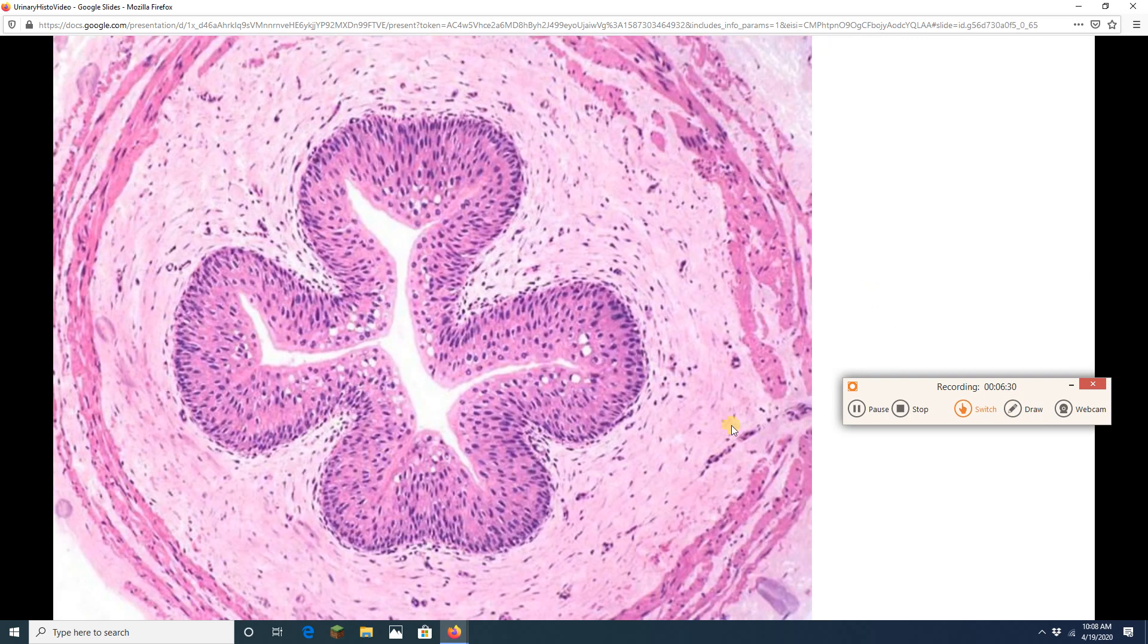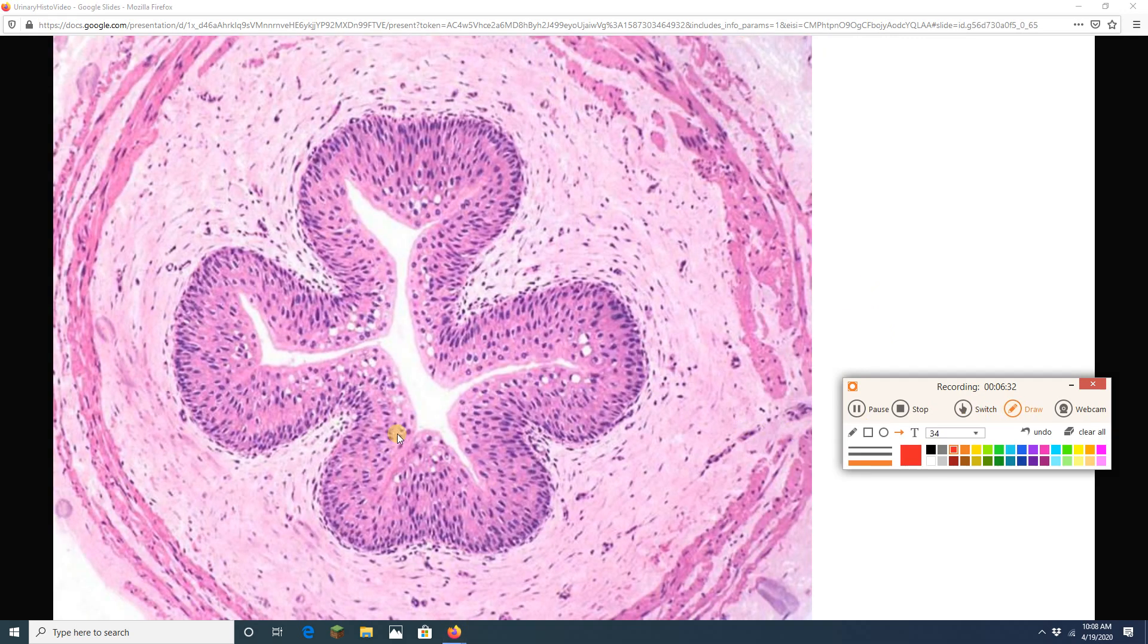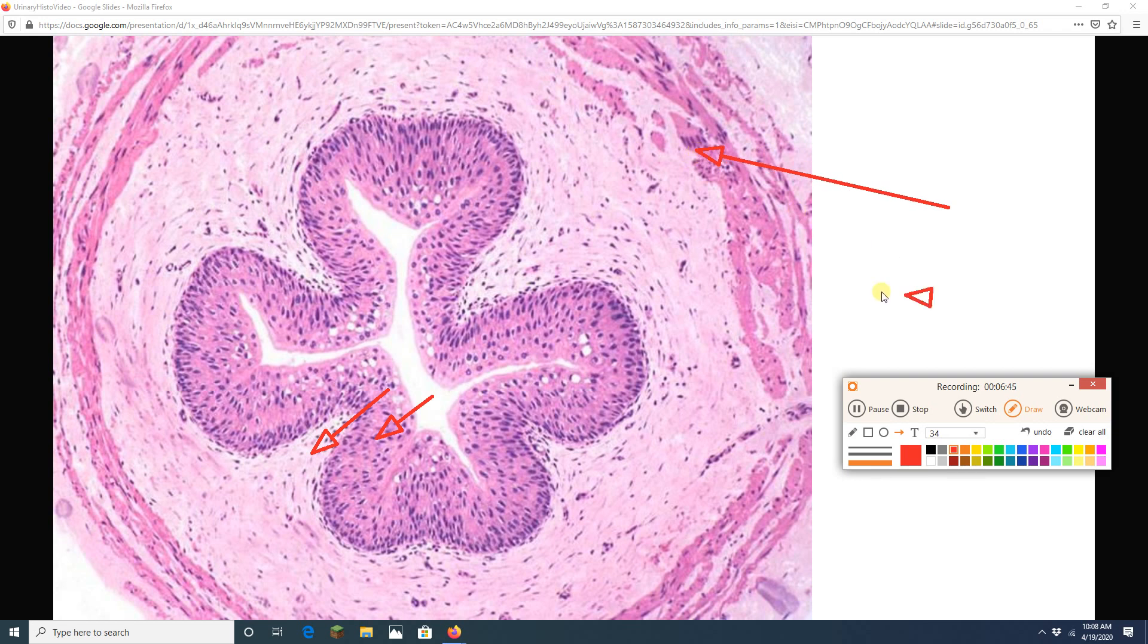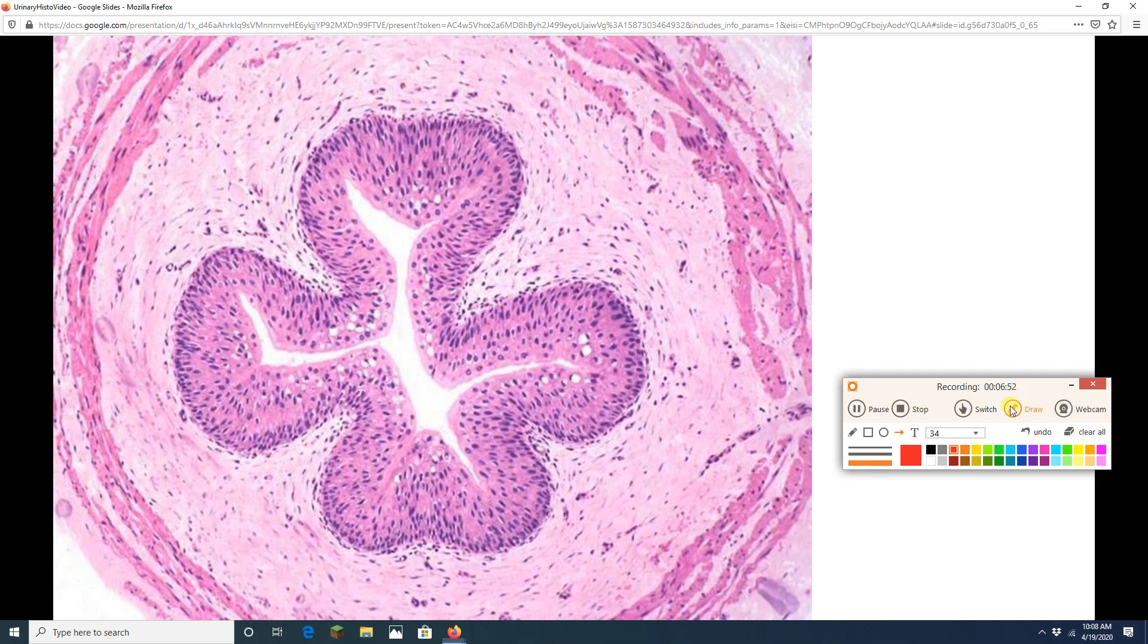Here we have another ureter. Again, we are going to have our transitional epithelium, a little bit of connective tissue lamina propria underneath it, and then we are going to have a lot of nice smooth muscle in here as well. Again check out the shape of that lumen. Always gets that like asterisk-shaped lumen.